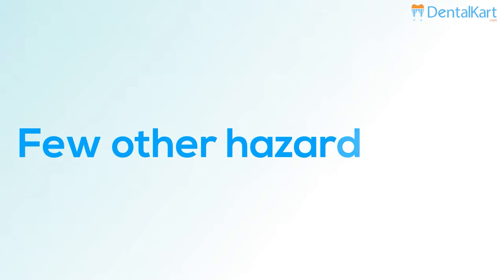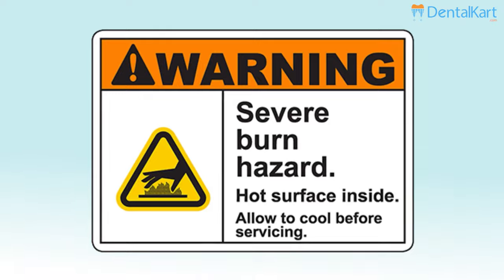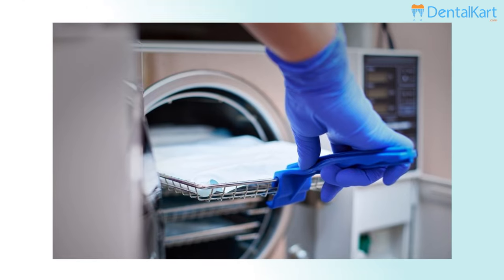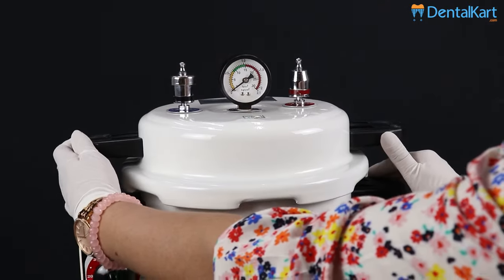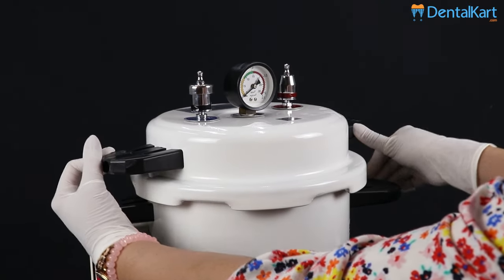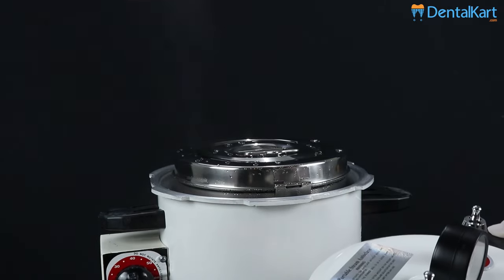The pressure and heat inside the chamber might rise and escape rapidly if not balanced, causing an explosion which could prove fatal. A few other hazards include burn hazard. Be cautious of hot surfaces when loading and unloading the autoclave, as the contents inside will be extremely hot. Make sure to keep your face, body, and hands away from escaping heat and steam when opening the lid.